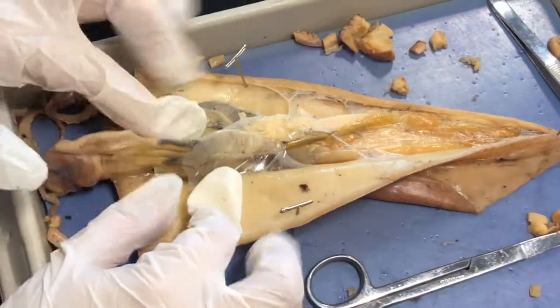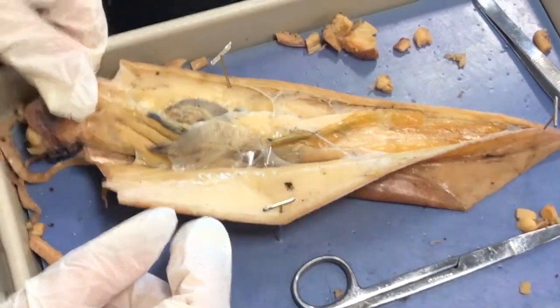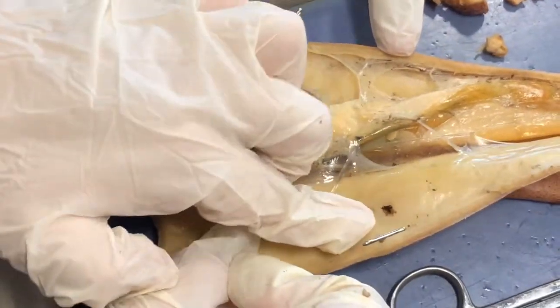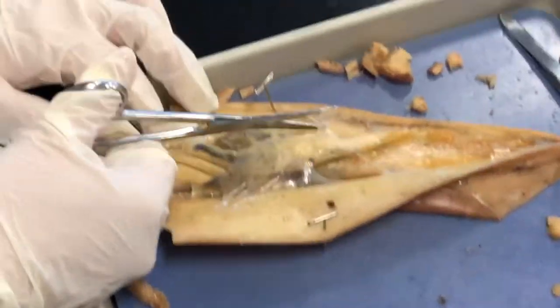The reproductive system of the squid, if male, consists of the testes, the seminal vesicle, and the spermatophore. Like the squid we have here, ours is female, of which all you can really see are the ovaries.